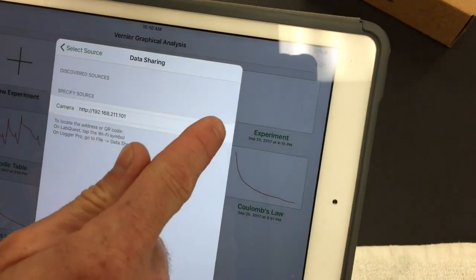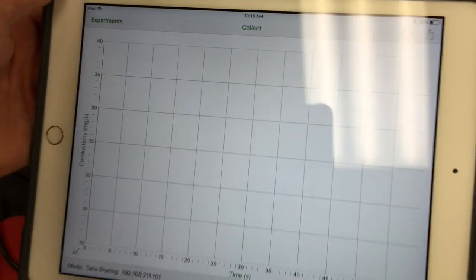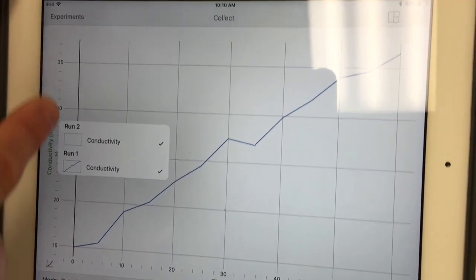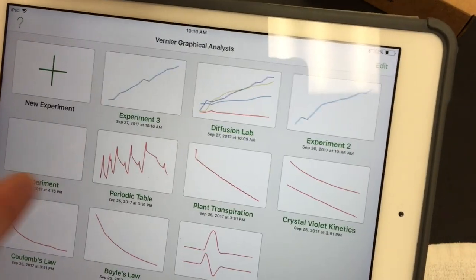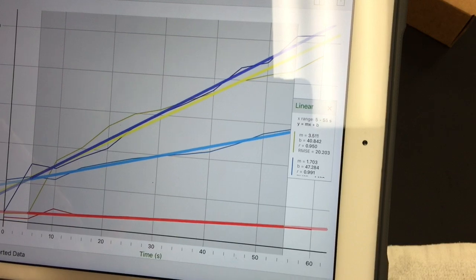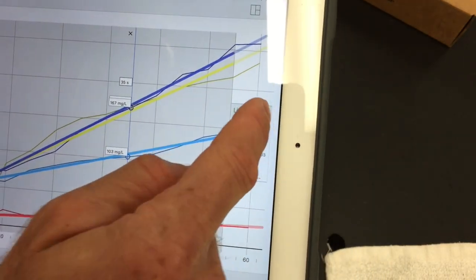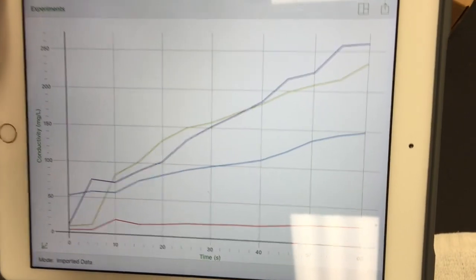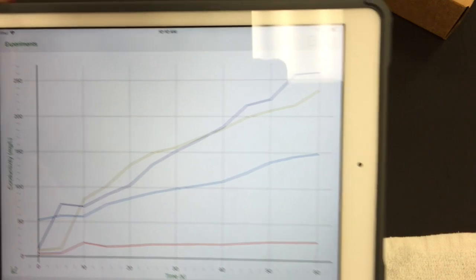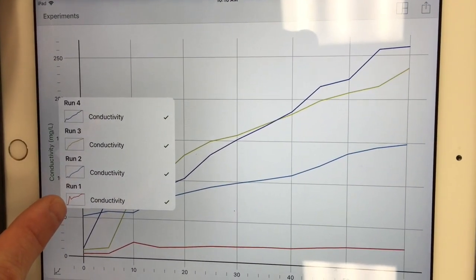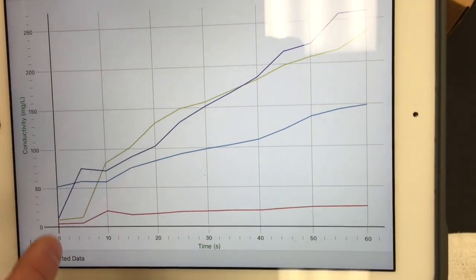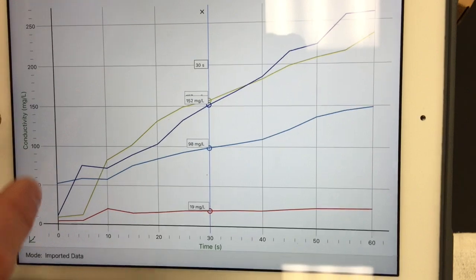It might not show up right away. You can always select the y-axis and click on the graph that you obtained. Your graph should have all four runs, so I'm going to bring up an older one that I've previously done. There's the four runs. For your write-up you're going to want to label all four of them, so it might be handy to remember that Run 1 in my example was 1%, Run 2 is 5%, Run 3 is 10%, Run 4 is 15% salt solution. That would be good to label those lines.